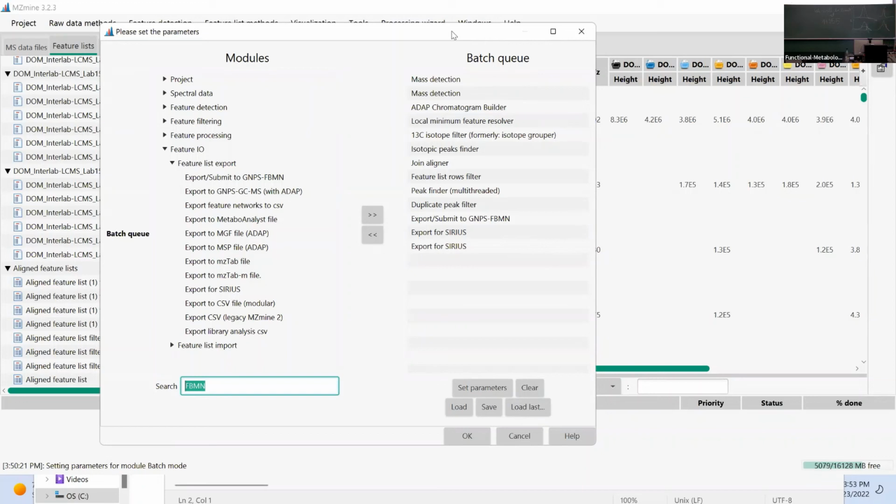I mean, you typically want to keep the raw data in MZmine. If you look at memory consumption by Java apps in the task manager, it doesn't really tell you the truth. So it might say MZmine is taking up 90% of your memory, but it's actually not doing that. It's lazily giving it back to the OS if the OS demands to have more memory.